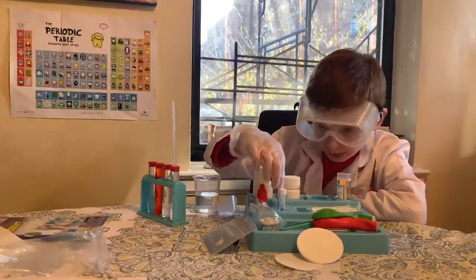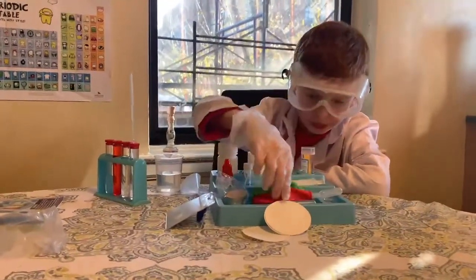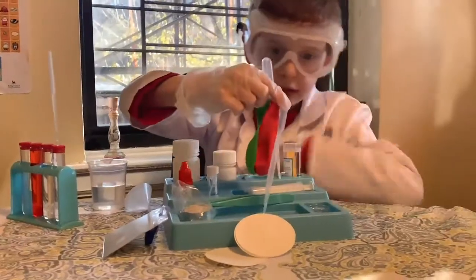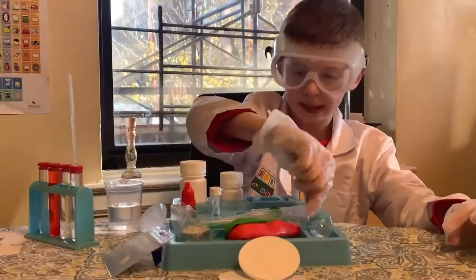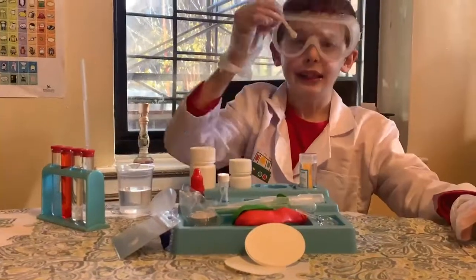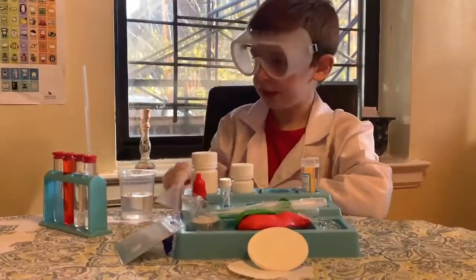What is this? Some string, lamp, balloons, tweezers. Pipettes, a little magnifying glass, three little teaspoons, funnel, test tubes.